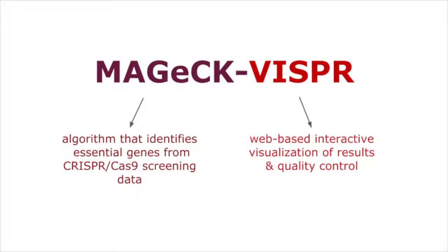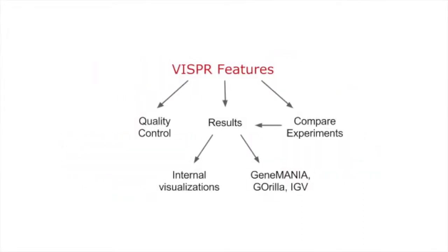Vispr is a visualization framework for exploring results and quality control data from CRISPR Cas9 screens. The interactive interface it provides is the final product of the MAGIC Vispr workflow.